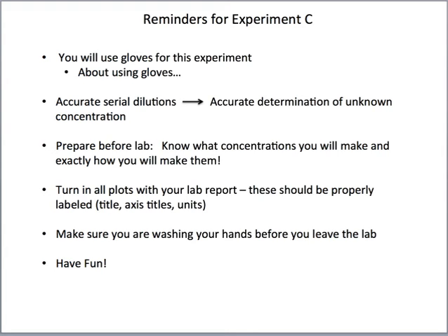Then, a reminder that you should turn in all plots with your lab report properly labeled: titles, axis titles, units. I already talked about the Beer-Lambert plot, including the lambda max value. Make sure you do that.